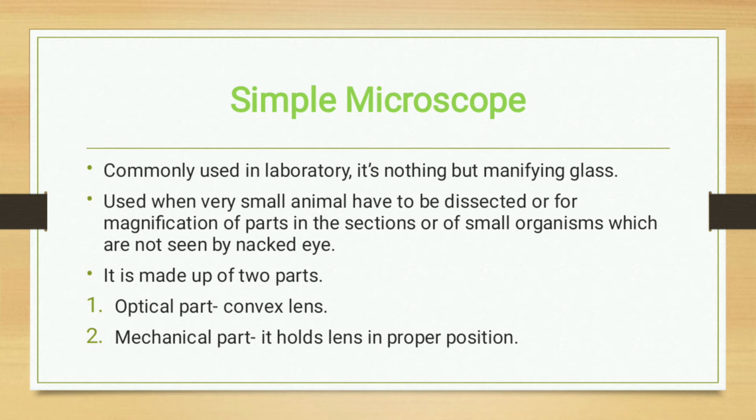So with these microscopes we simply see the magnified parts of that section or of that organism.